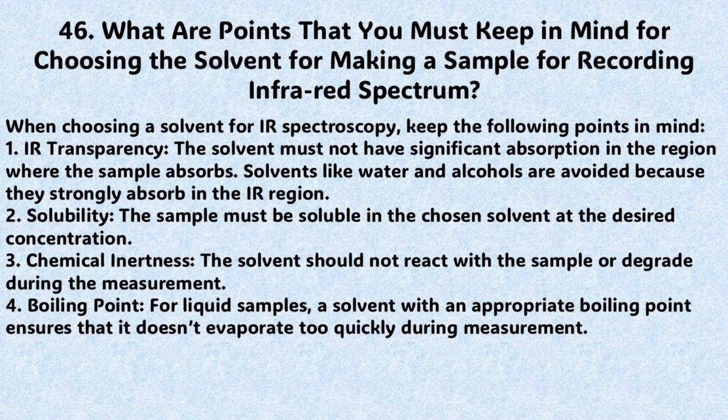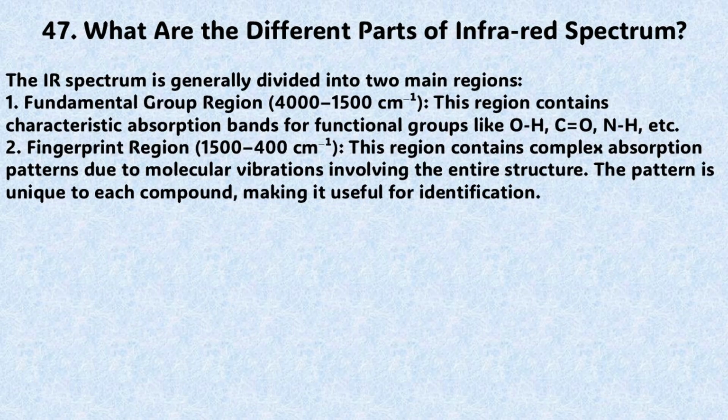Solubility: the sample must be soluble in the chosen solvent at the desired concentration. Chemical inertness: the solvent should not react with the sample or degrade during the measurement. Boiling point: for liquid samples, a solvent with an appropriate boiling point ensures that it doesn't evaporate too quickly during measurement.